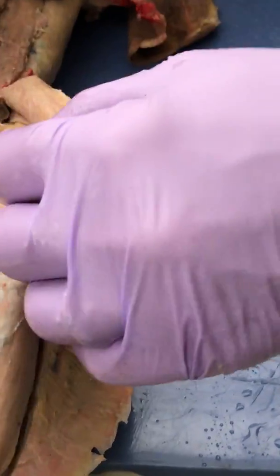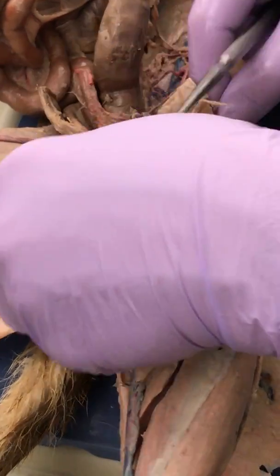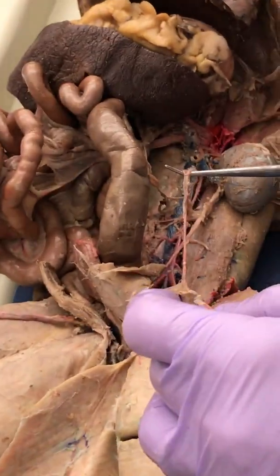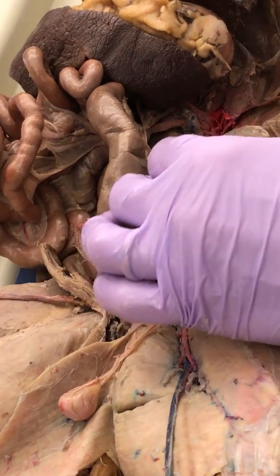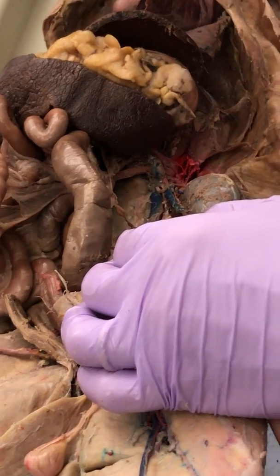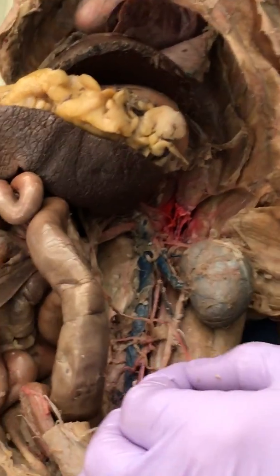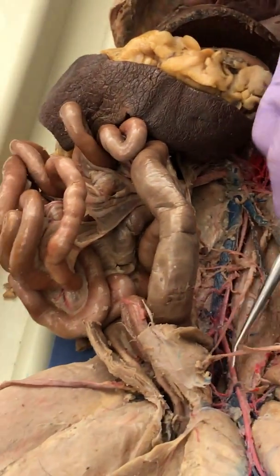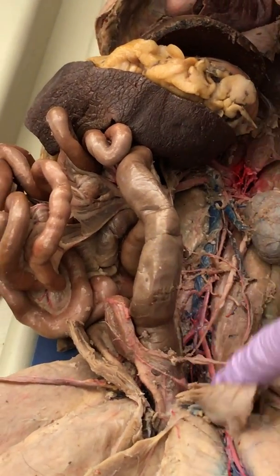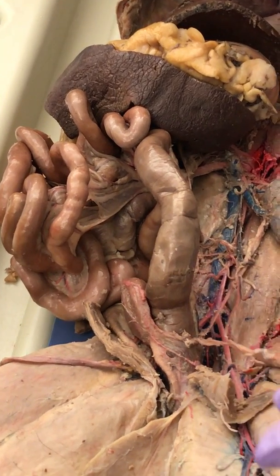So look how cool your cat is, because this came through his abdominal wall, kind of like that. And then you're so good, you still have his testicular artery intact. You really still have his testicular vein intact too. It just didn't get any latex in it. See that tissue right there? And then you still have your vas deferens intact right there. So that's really good.